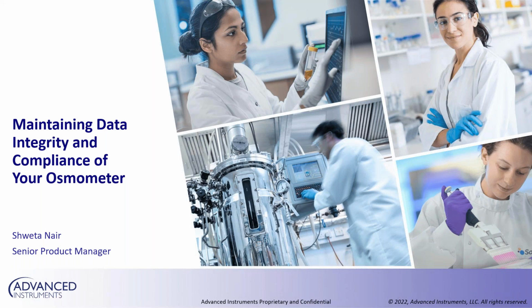Over to you, Shweta. Thank you, Jared. Thank you, everybody, for joining us today. As Jared mentioned, I'm really going to be spending some time today discussing how to maintain data integrity and compliance in your workflows with analytical equipment in the lab, especially something like our osmometers.